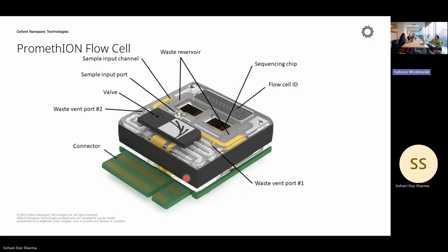So if any optimization is needed, that is something you have to do. We would definitely help you out, but presently I don't have any data I can share which will help you get rid of the gDNA. For plasma DNA, we have not observed what you are getting.